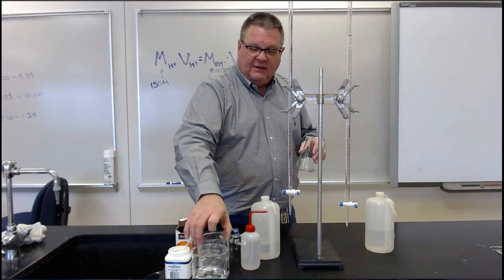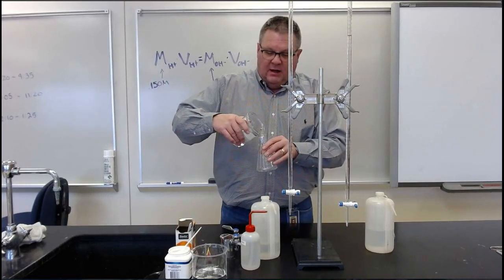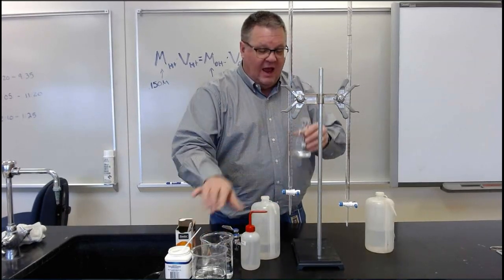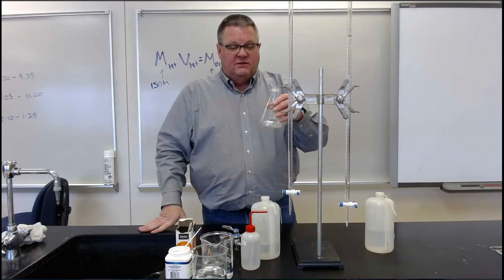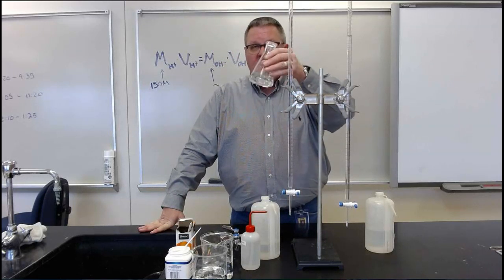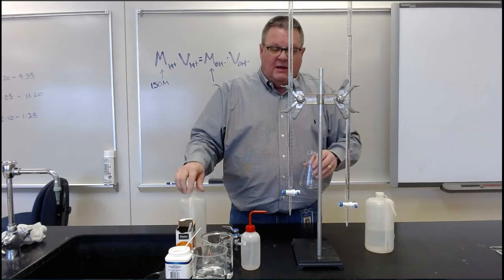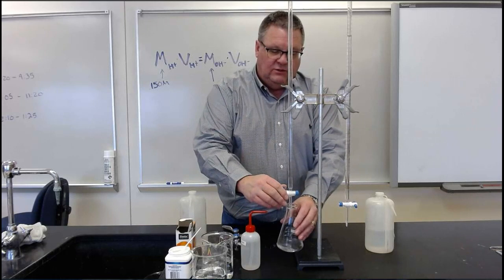If I want to add a little water to this, that's fine. I can add a little water to it. It's not going to change anything because I haven't changed the moles of acid in here yet by adding water. The total number of moles of H plus are still there. Okay, it just gives me a little more volume so that I have a little more to look at and observe. Now I'm going to add base to this.